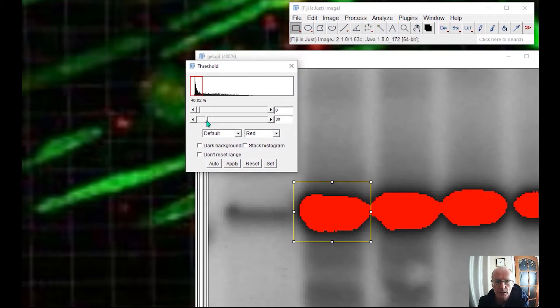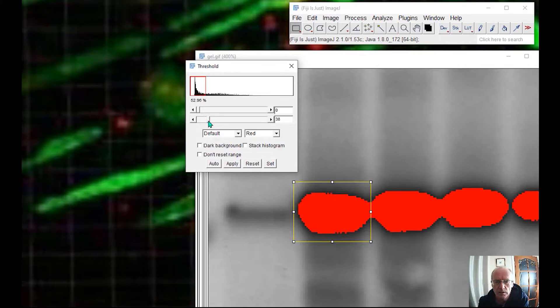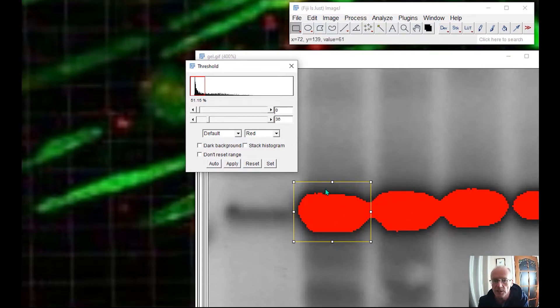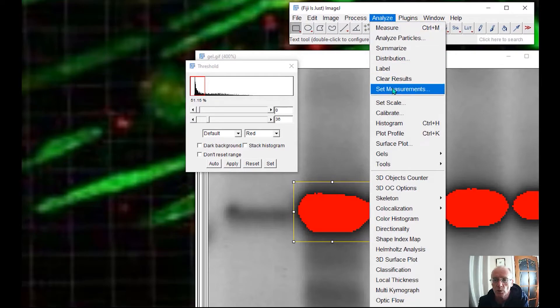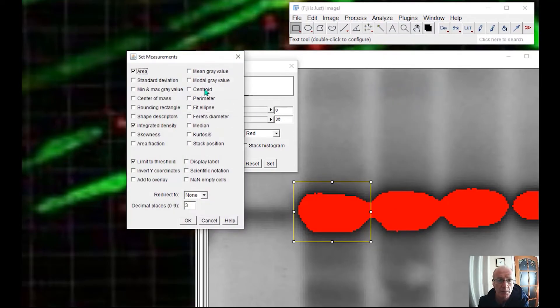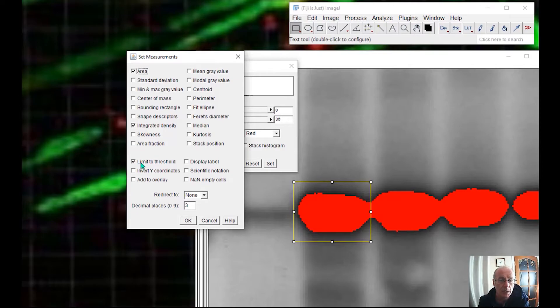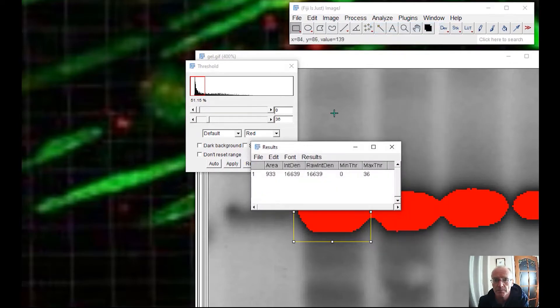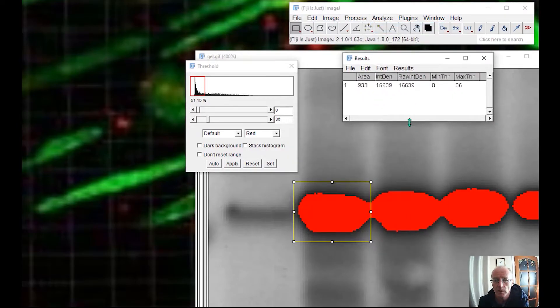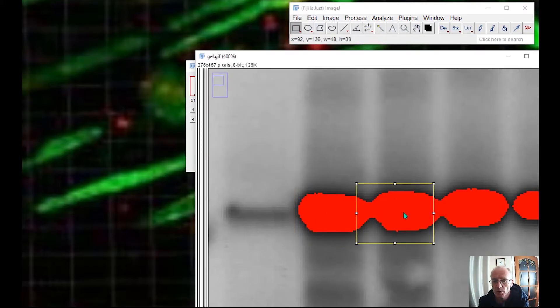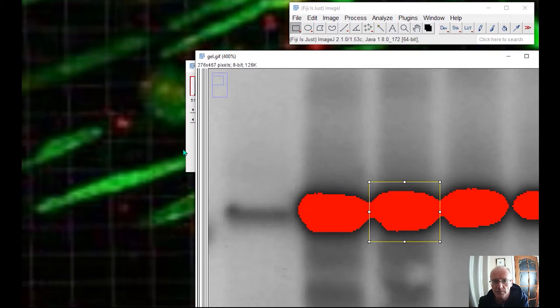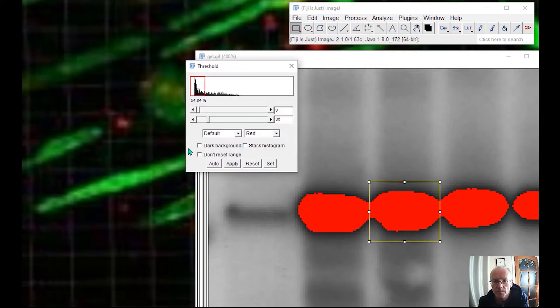So let's say that just about covers the first blob and it's within this box. It's not bleeding into this channel. So I will choose. First of all, I'll set my measurements to make sure I've got the area and the integrated density. I'm going to limit my measurement to what's under the threshold and choose measure. And then I'd maybe want to move the box to here, but make sure that I don't have anything that's in this lane. Make sure it's all in this lane.